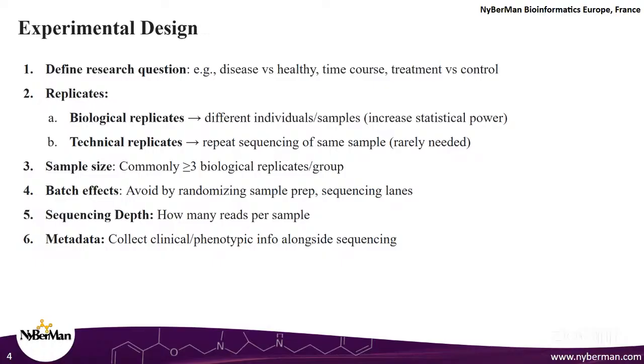it could so happen that when you actually perform the statistical analysis, the differences that you end up catching are actually not related to the biology but more related to the fact that you sequenced them in separate batches, right? This is something that is very common in biology experiments, especially in sequencing experiments. That is why it is always advised that please randomize these batches. So for example, in the first batch I will randomly choose 2 of my control samples and 3 of my disease samples to run my sequencing.